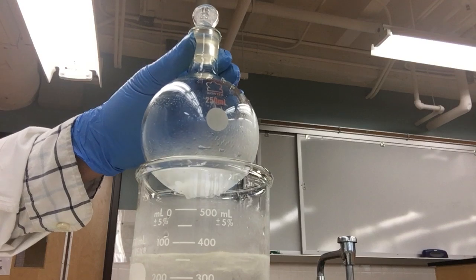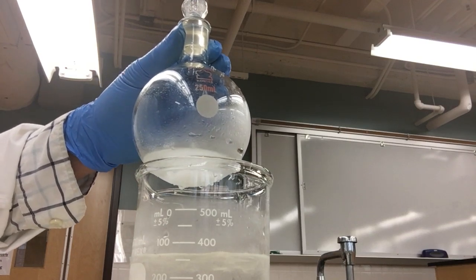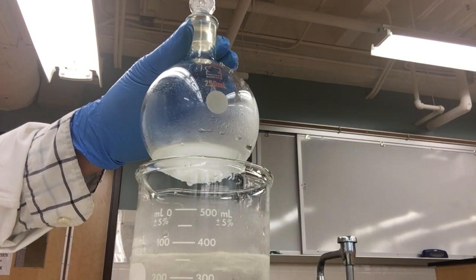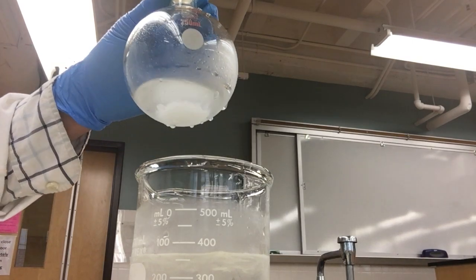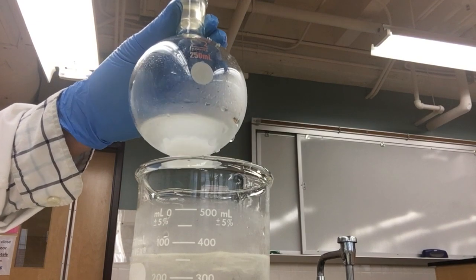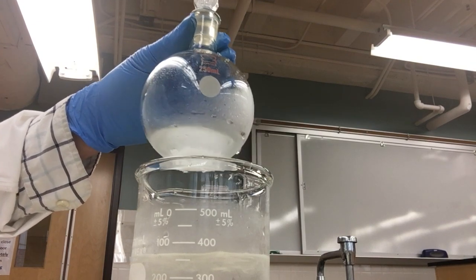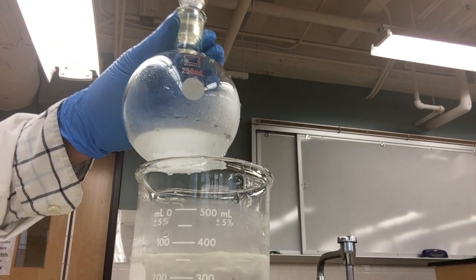You have to be very careful because this is concentrated sulfuric acid. It's not dilute or mildly concentrated either. As we add the sulfuric acid to this, it's going to generate a lot of heat as the acid dissolves and becomes more dilute in the 8 ml of water. It's a very exothermic reaction.